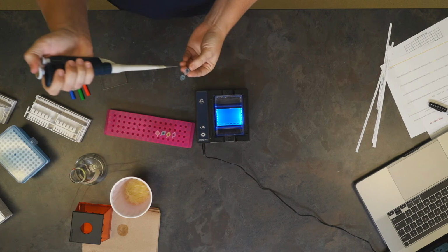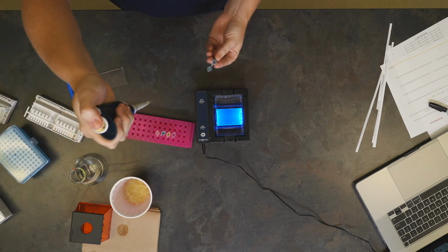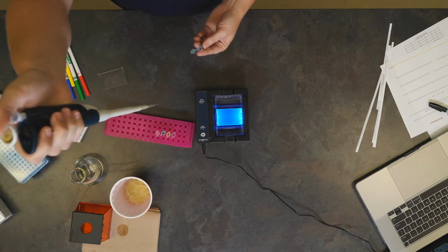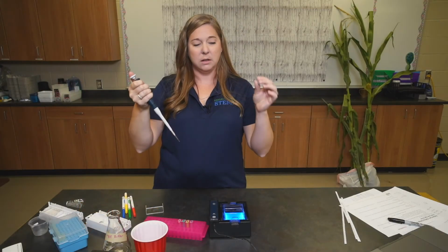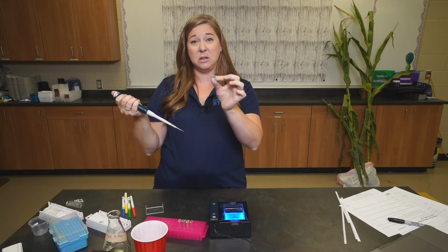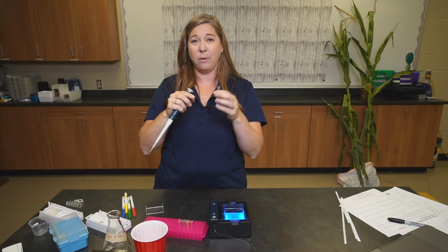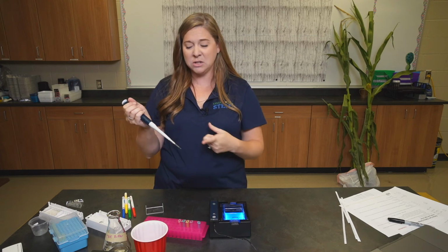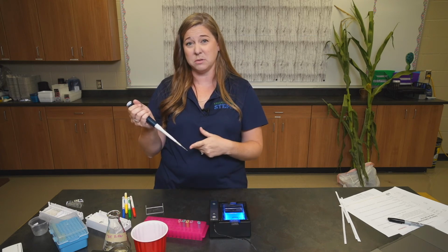Open the tip. Go ahead and depress the plunger. Put it down in and withdraw the sample. Now that the sample is completely used up in this, I could throw it away. However, I like to have my students cap it and put it back so I can make sure they actually drew up the sample they were supposed to.